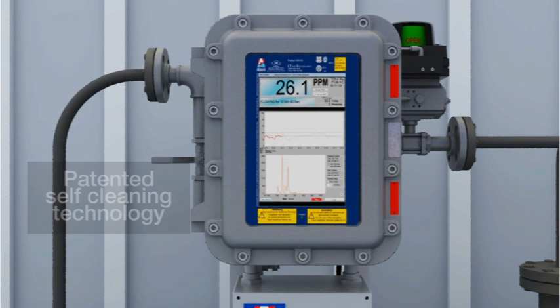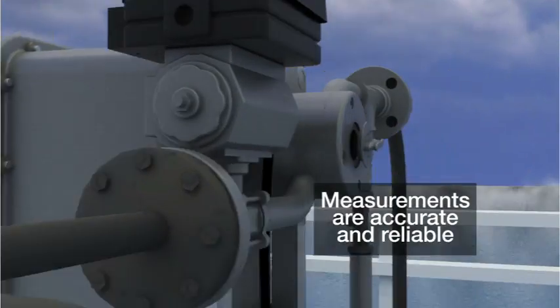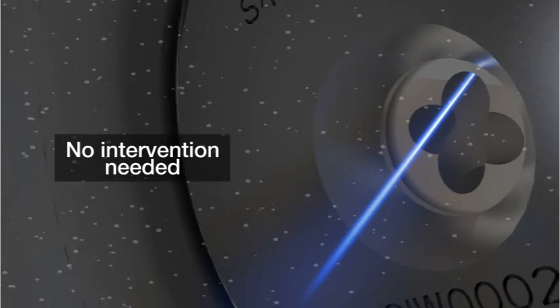Once installed and utilizing Advanced Sensors' patented self-cleaning technology, the analyzer ensures that the measurements reported are accurate and reliable, with no intervention needed.